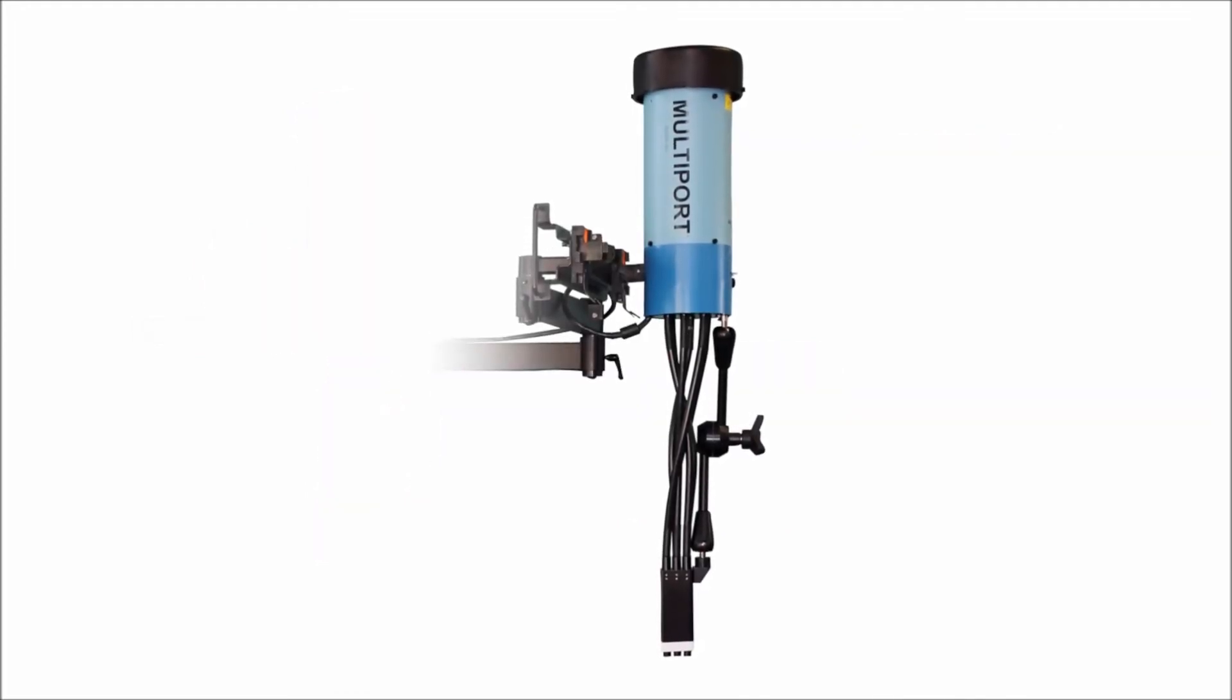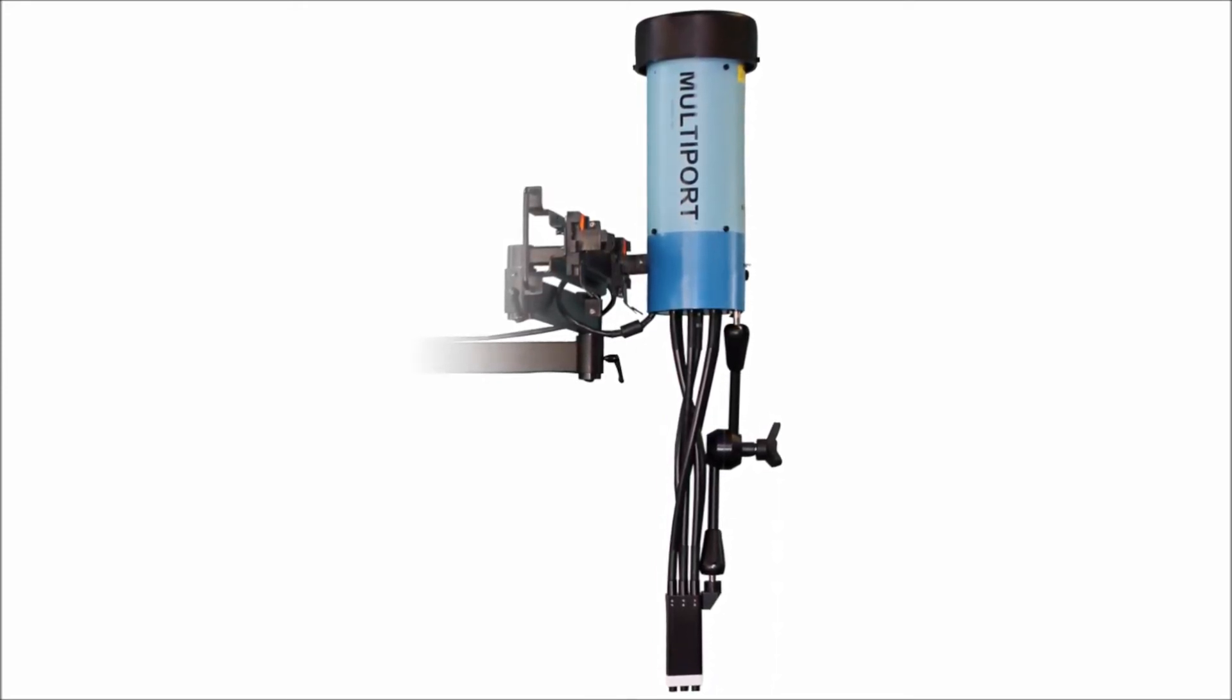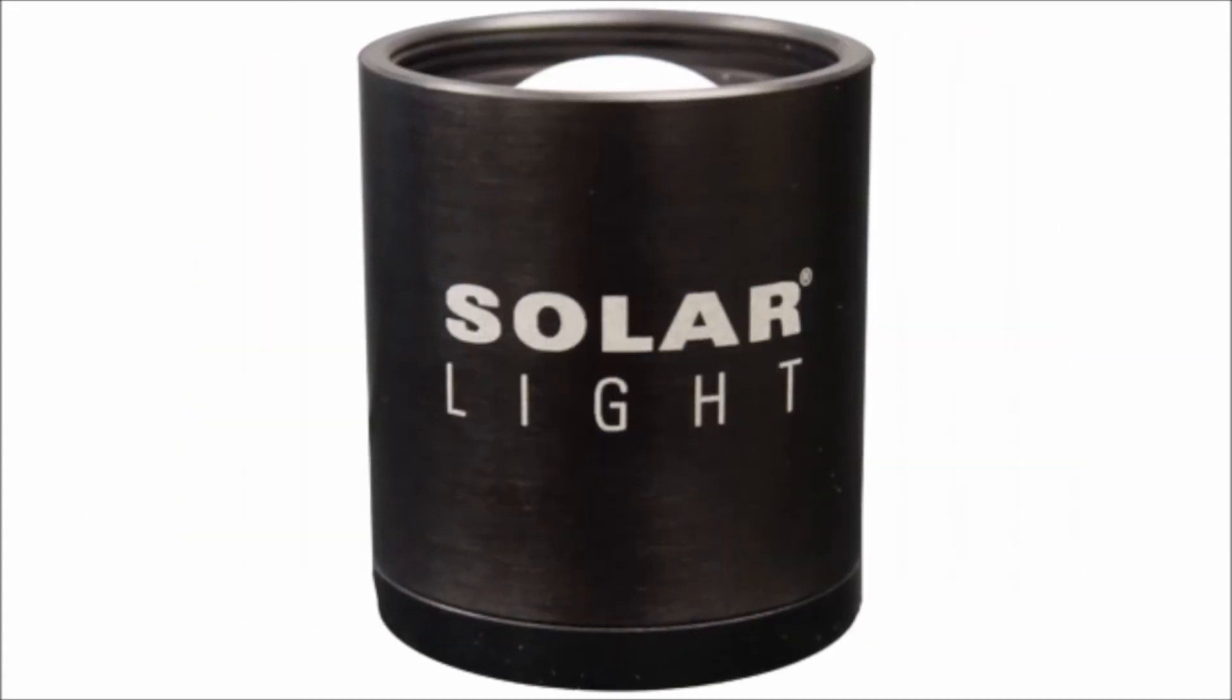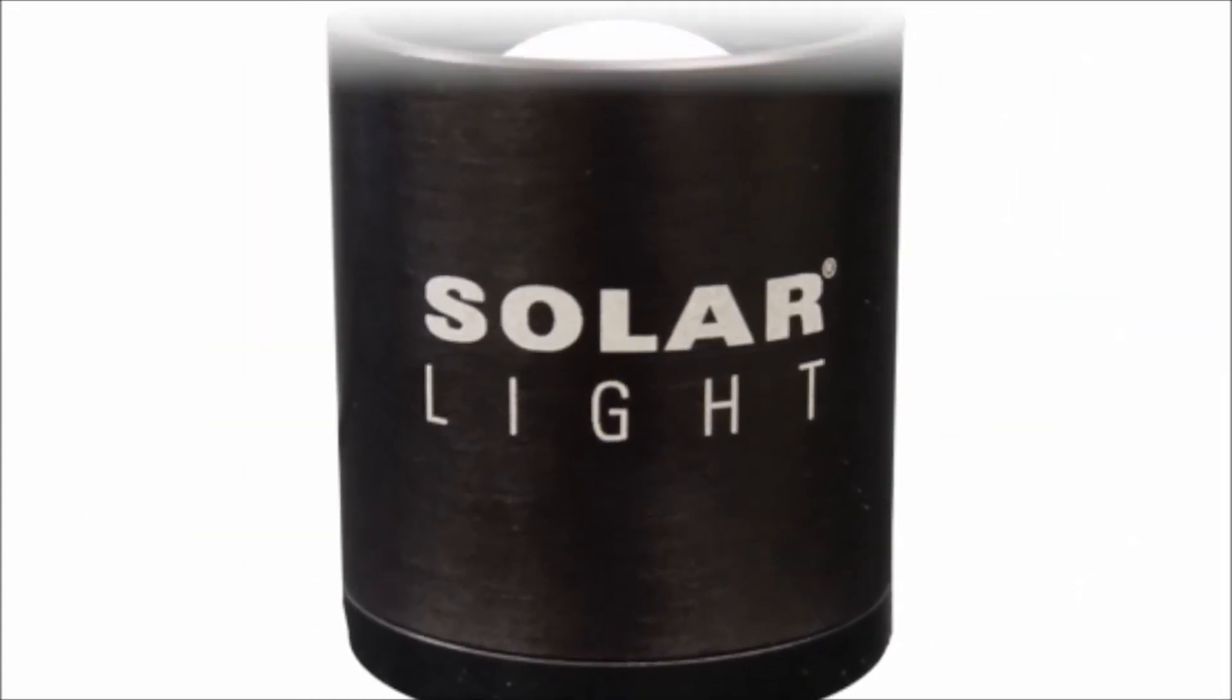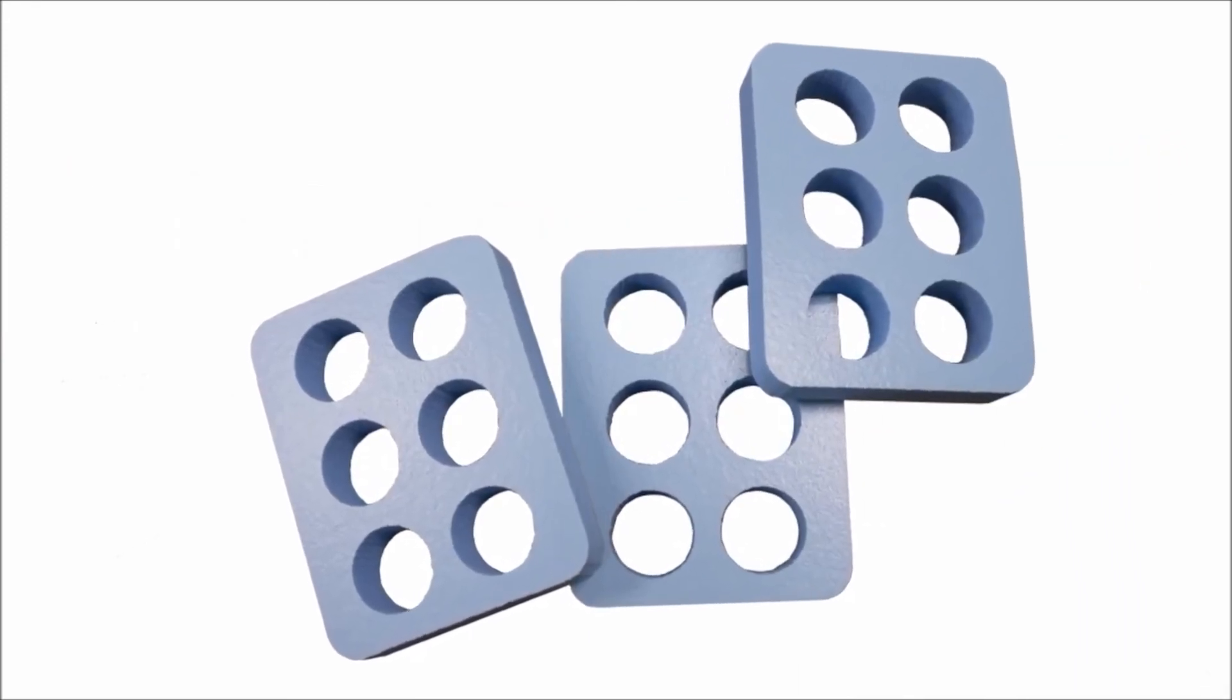Everything required to begin testing is included with the 601 multiport: the six output simulator, DCS2 automated dose controller, NIST traceable PMA series sensors, safety glasses, and a starter pack of 100 disposable hypoallergenic placement pads.